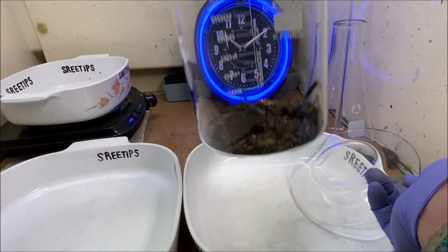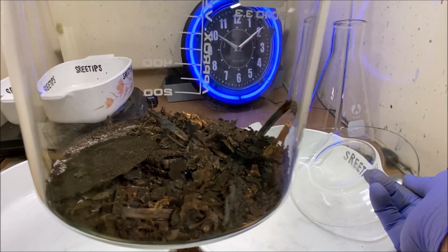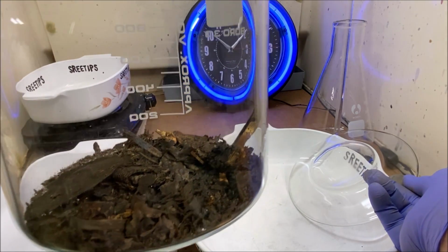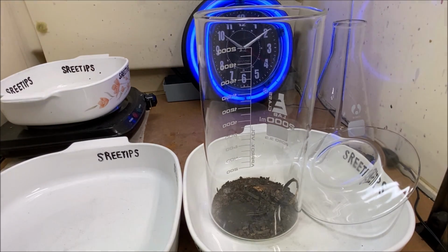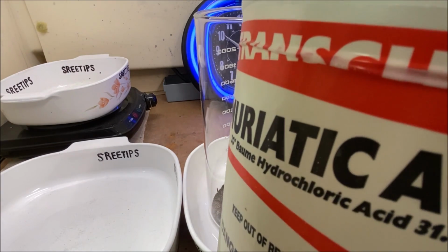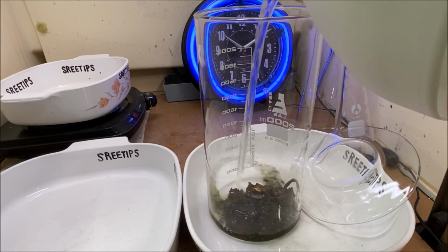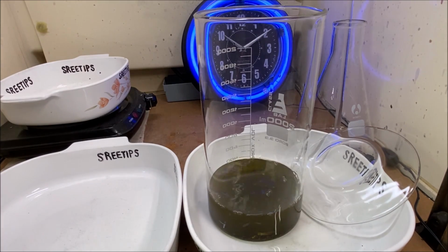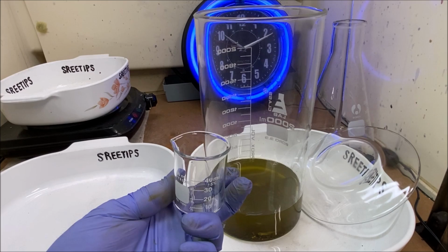Here's what the foils look like down in our beaker. It's just hollow shells that retain their shape in some cases of what they used to be. We're going to begin the refining process now by adding some hydrochloric acid. I had about 400 milliliters of hydrochloric acid. Now what we'll do is measure out some nitric acid.